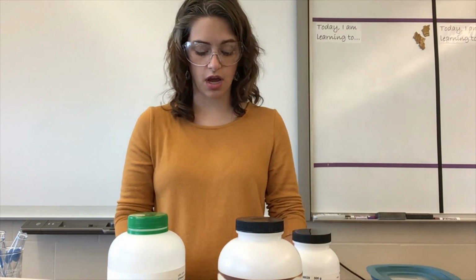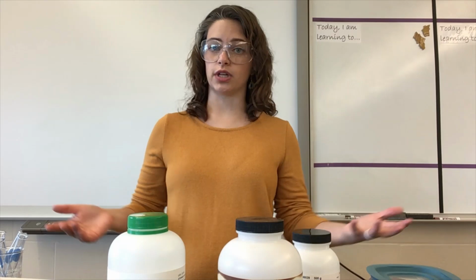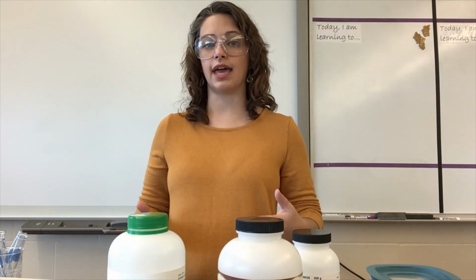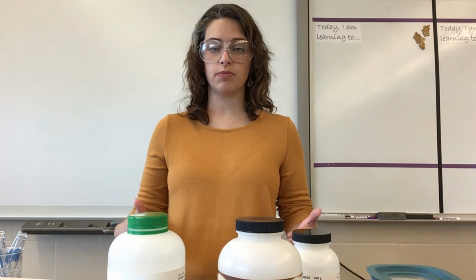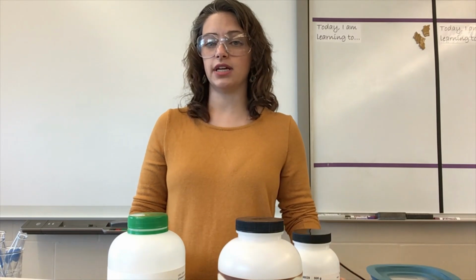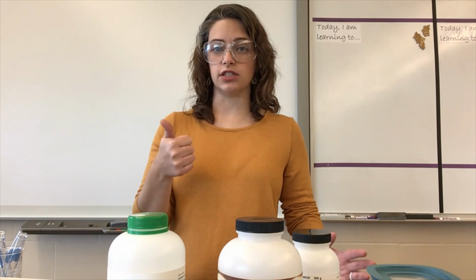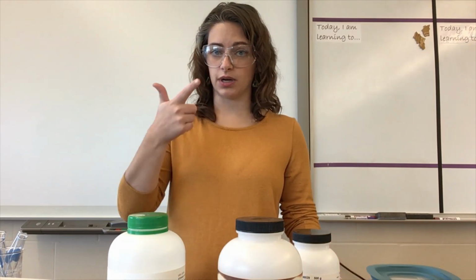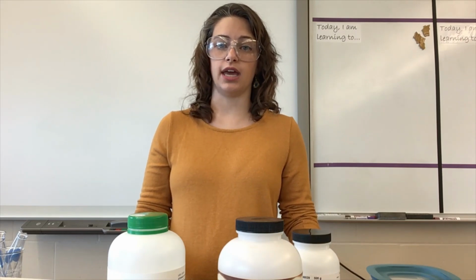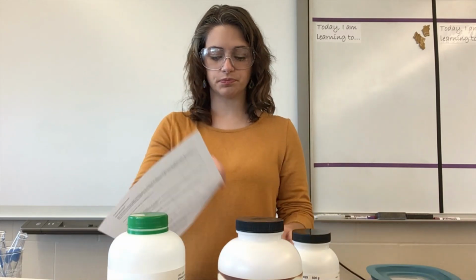For each of our compounds, we're going to test a selection of different things. So we are going to make notes on the appearance. So we're going to take a look at how they appear. We're going to test whether they dissolve in water, so their solubility. So we're going to add some water, see if they dissolve. We're going to test their conductivity, so whether or not they conduct electricity. We're going to test both in solution, if it dissolves, and as a solid. So we're going to test conductivity twice. And then we're going to look at the melting point. So we're going to see if it requires a high temperature or a low temperature to be able to melt.